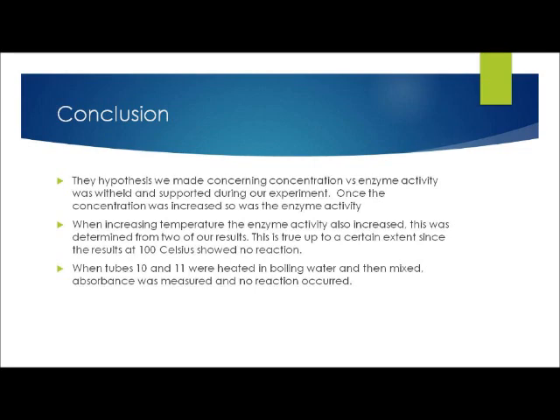Our conclusion is that the hypothesis we made concerning concentration versus enzyme activity was supported during our experiment. Once the concentration was increased, so was the enzyme activity. When increasing temperature, the enzyme activity also increased. This was determined from two of our results. This is true up to a certain extent, since the result at 100 Celsius showed no reaction. When tubes 10 and 11 were heated in boiling water, and then mixed, the absorbance was measured and no reaction occurred.